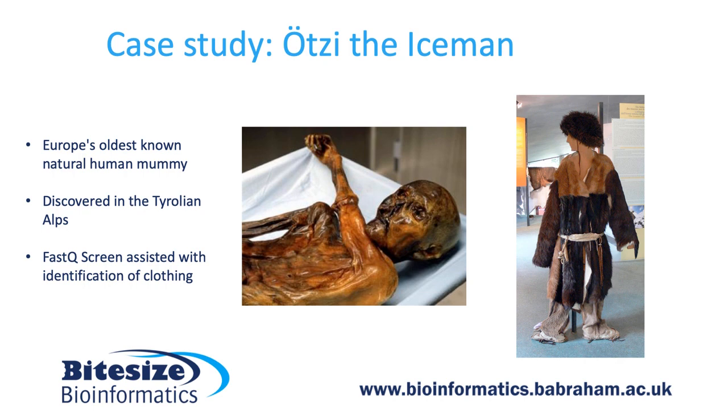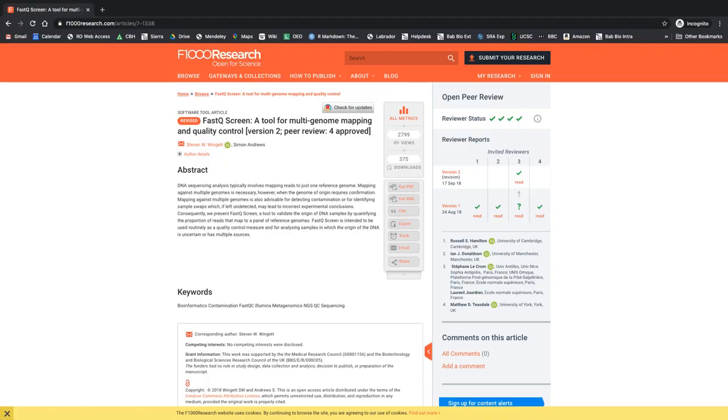Needless to say, I found this very interesting and quite delightful that a tool we had put together at Babraham to QC the samples that had come off our sequencer had been used in such an unexpected and fascinating way. If you would like to read more about FastQ Screen, in addition to the online documentation, I should just let you know that the software has been published in the online open access peer-reviewed journal F1000.